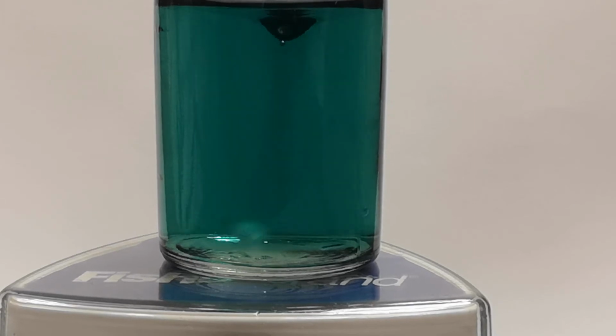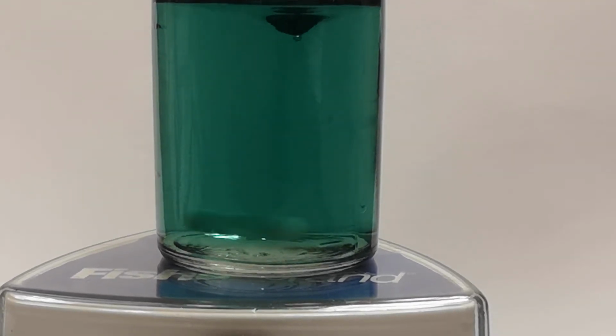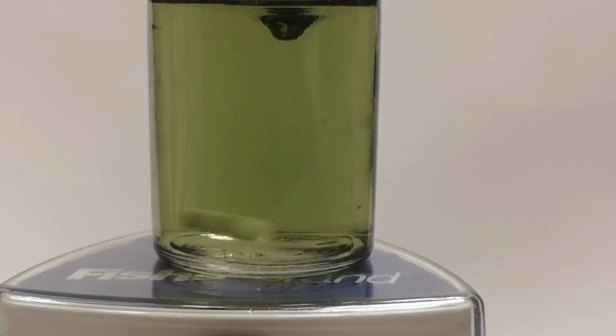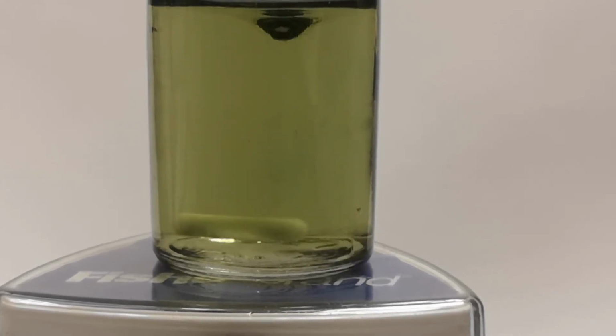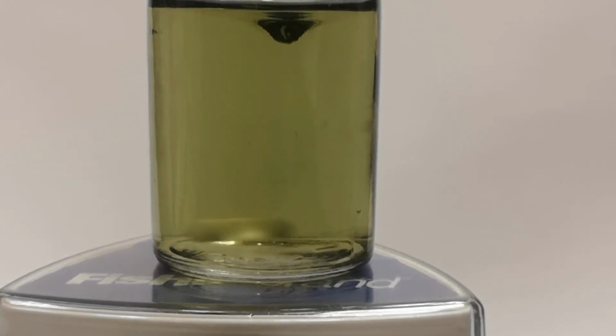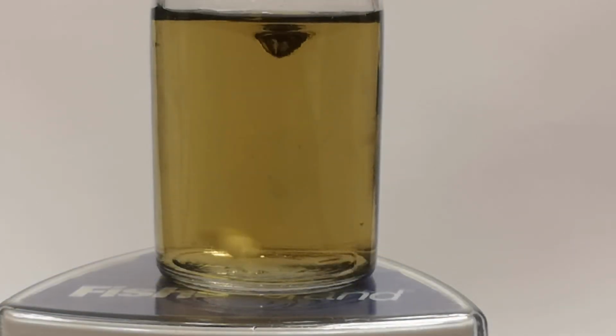You prepare a solution of sucrose in dilute sodium hydroxide and then add purple potassium 7 manganate. The purple is characteristic of manganese 7. The solution immediately turns bluish and soon becomes green. This is manganese 6+. The blue colours are simply due to colour mixing. Manganese 5+ is blue, but is not stable enough to manifest itself here.